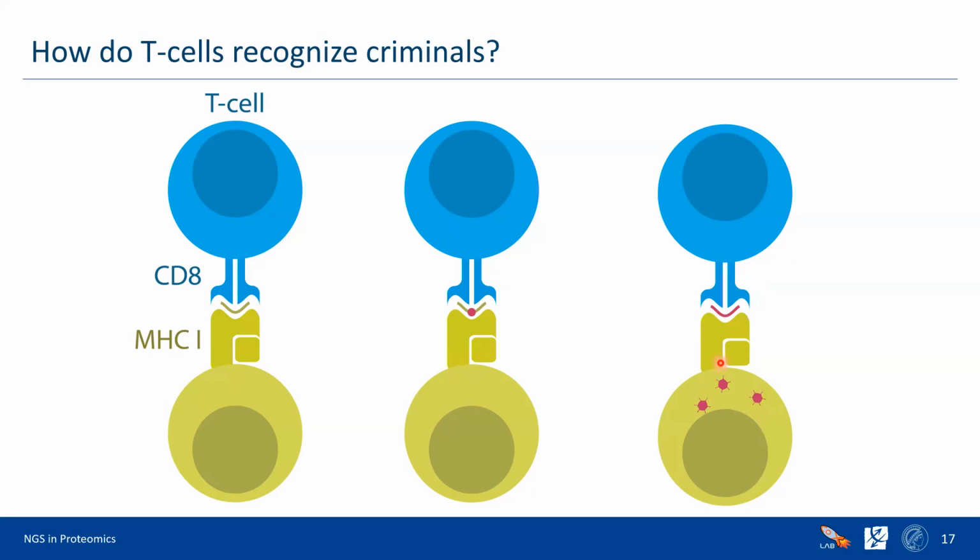But in this study, which we did in our group, we were focused on the cancer story. And why is it so interesting to study? The reason is, if we were able to systematically and robustly identify mutated peptides and mutations which appear during cancer development, then we would be able to synthesize this peptide and really train the immune system against it.